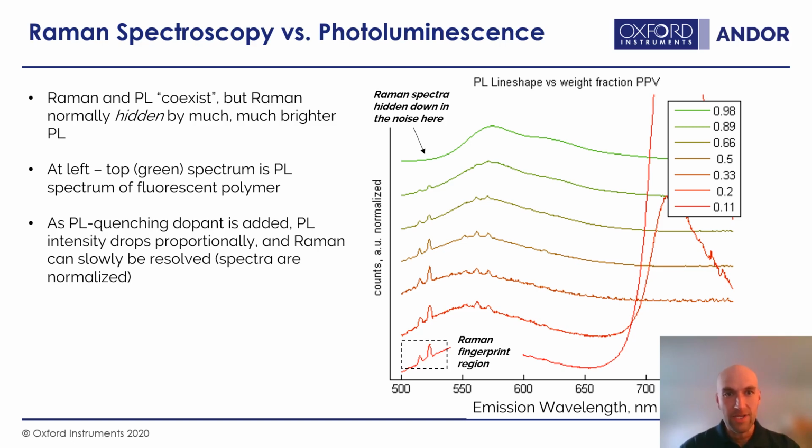And you can see here is the undoped. So there's nothing in it. It's mostly, well, almost pure, and it fluoresces in the green to yellow to red. So this is the photoluminescence spectrum. It looks a lot like the ones that I showed before, a pretty broad photoluminescence spectrum with some structure typical of a conjugated organic. And you'd say, okay, so there's the photoluminescence spectrum.